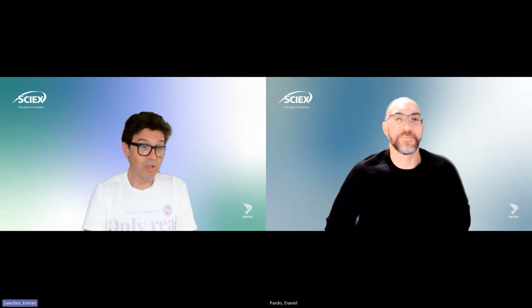We have to remember that Analyst will enter into the end of its life next year, up to July. After that moment, it will be only SCIEX OS available. So it's important that we discuss how people can transition, but especially why they should transition, and the new features that we have in SCIEX OS 5.0. So what's coming with it?